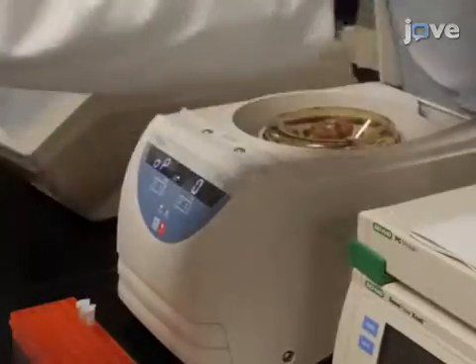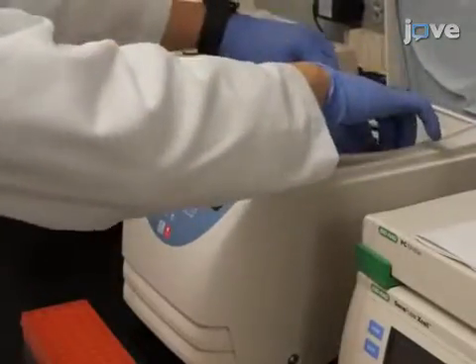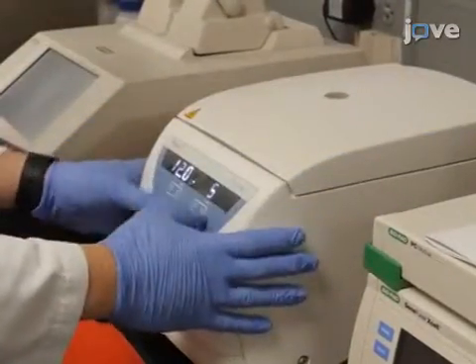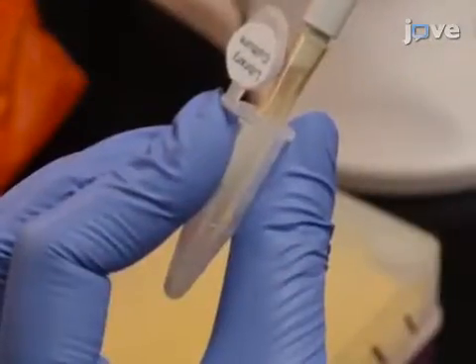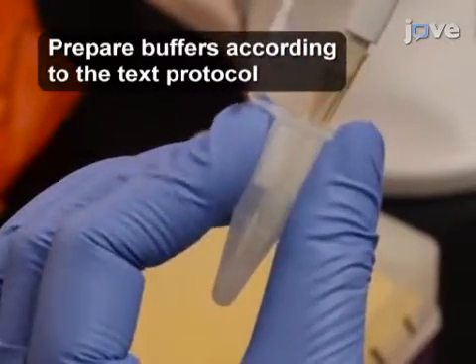Then centrifuge the calculated volume of induced culture in a 1.5 milliliter microcentrifuge tube at 12,000 times G and room temperature for 5 minutes. Remove the supernatant and use 100 microliters of ice-cold fractionation buffer (FB) to re-suspend the pellets.